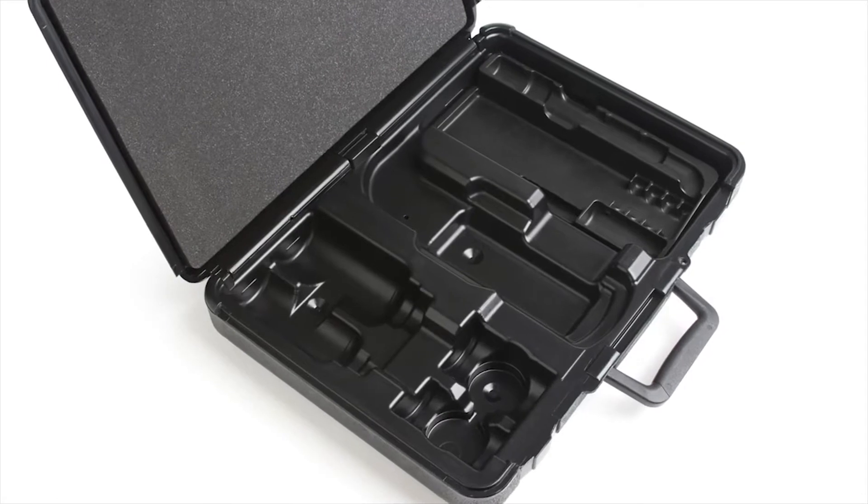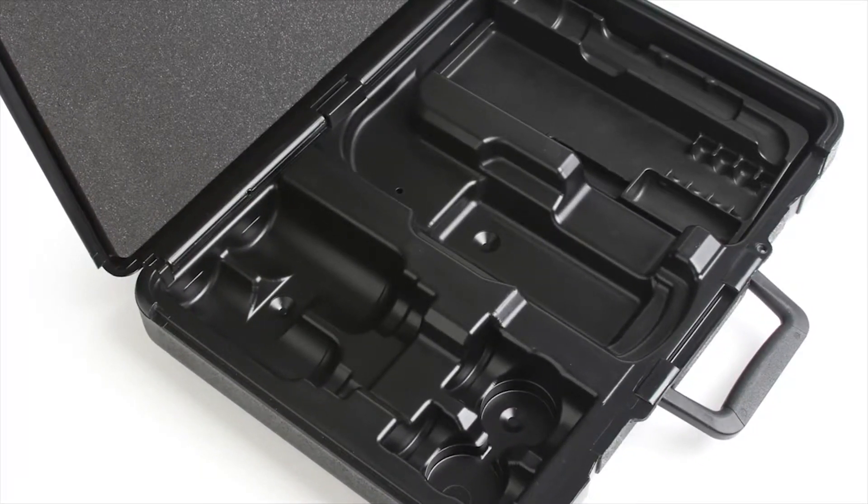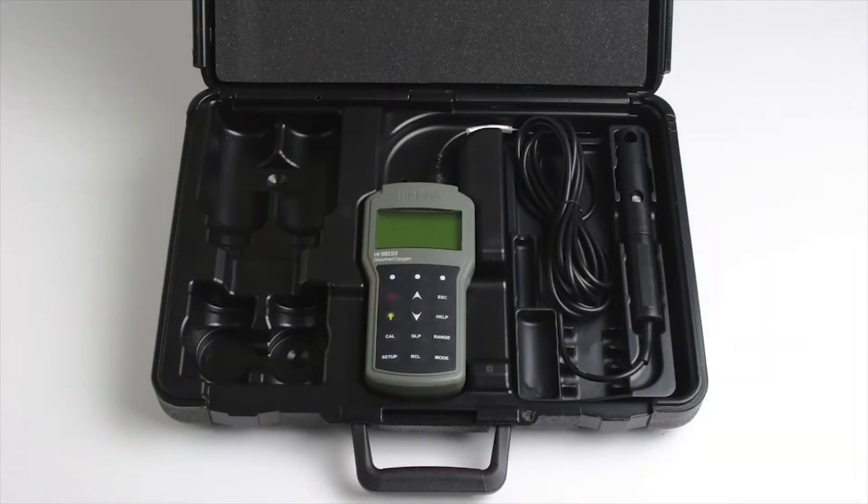The HI-98193 comes packaged in a rugged and heavy-duty carrying case that is thermoformed to secure the necessary components for routine measurements. In each case, along with your meter and probe, the following materials are supplied.